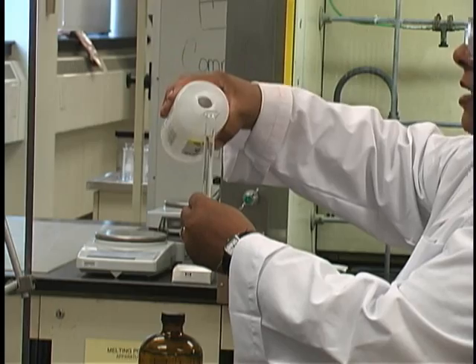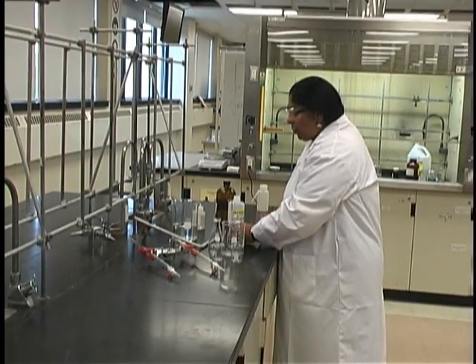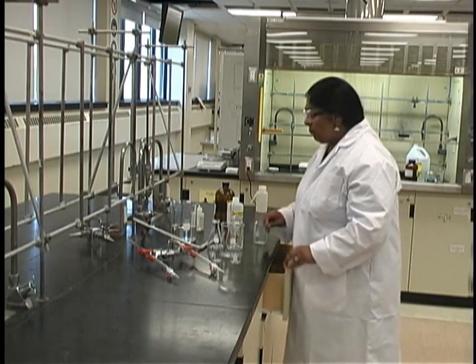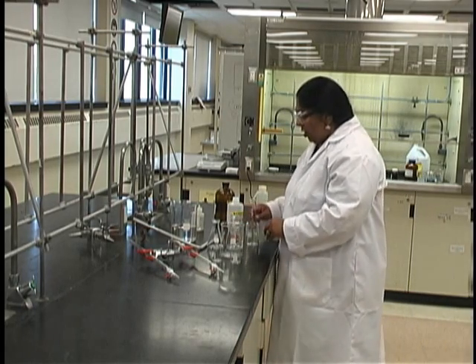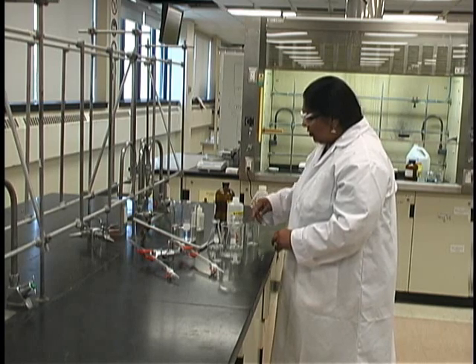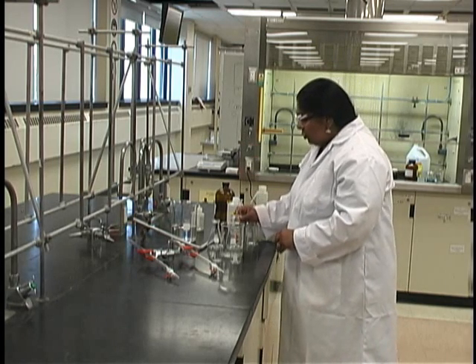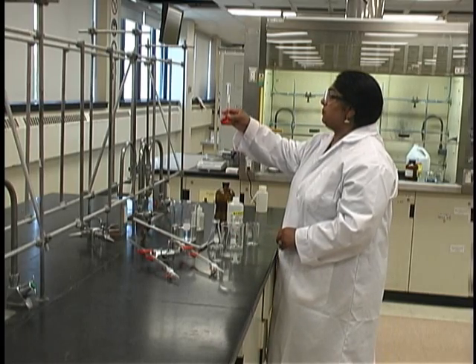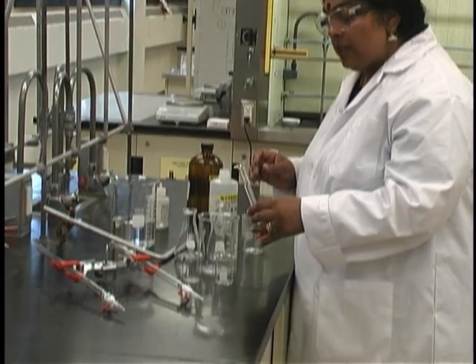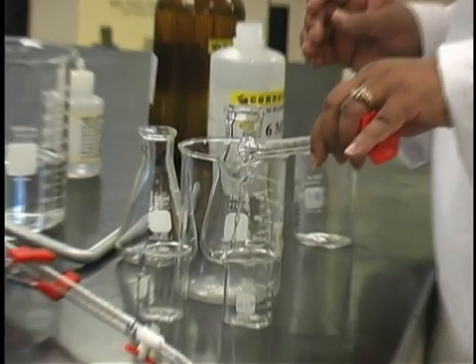The exact volume is not important, but it is important that you know the volume exactly. Also remember that a 10 milliliter graduated cylinder can be read to two digits after the decimal. Transfer this base solution to your 600 milliliter beaker.